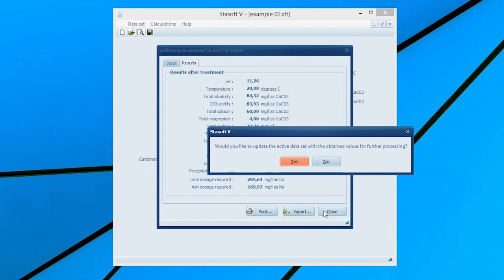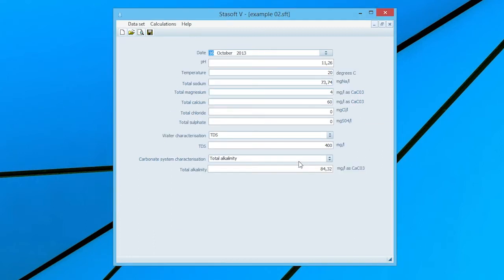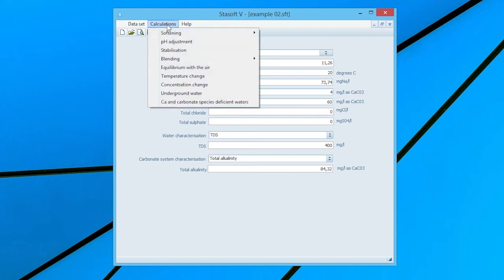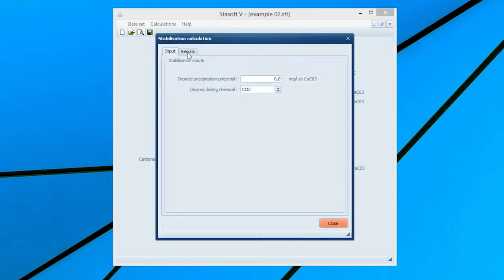Selecting the Close option allows the user to update the active data set with the present water's characteristics for further processing in the Update Data Set window. Select Yes and then select the Stabilization option from the Calculations menu, bringing up the Stabilization Inputs window for the recarbonation of the present or active water.